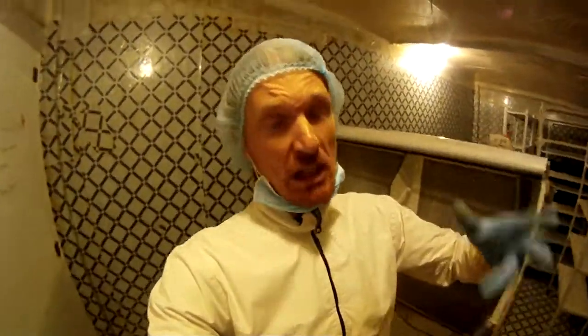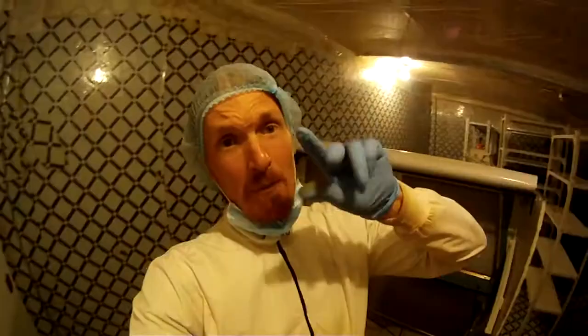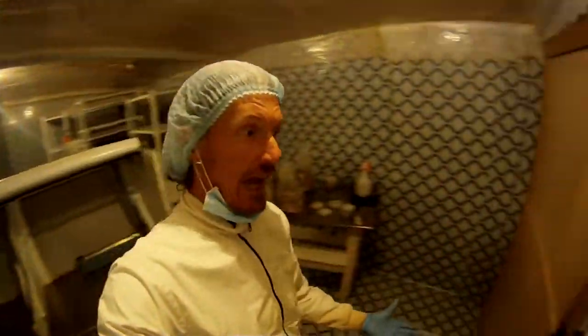To get into the lab, it's quite the operation in and of itself. I take a full shower, clean myself real good, cut my hair, make sure I'm all clean and tidy. Then I put on my lab underwear, and then my walking-to-the-lab outfit. I've got three doors to get into this thing. In the first chamber I take off my walking outfit, enter the second chamber and put on my lab clothes - lab jacket, lab pants, hairnet, face mask, gloves - and step into the actual lab.